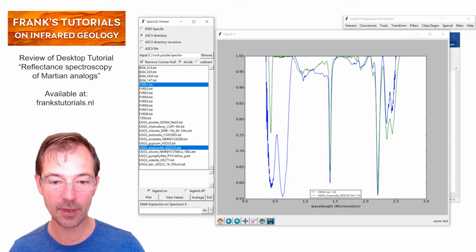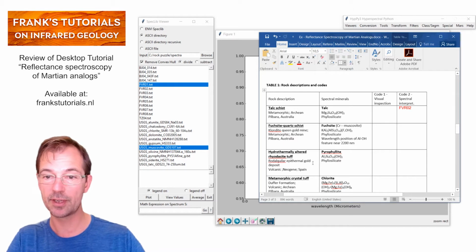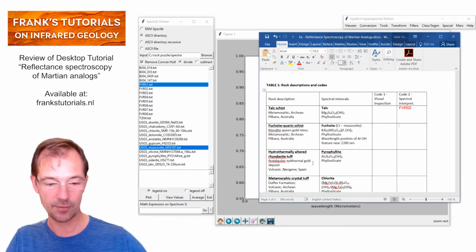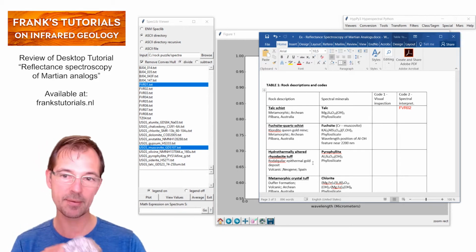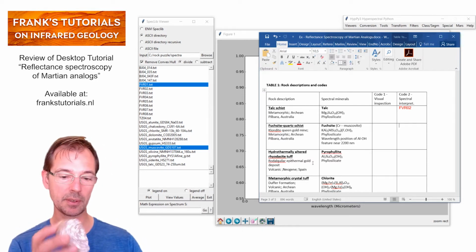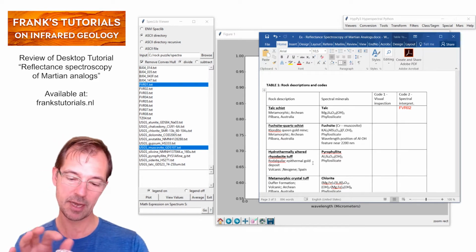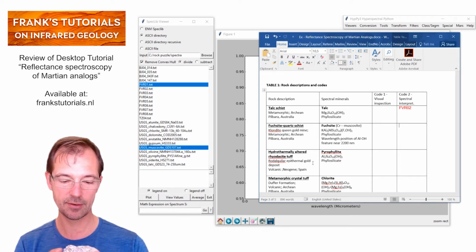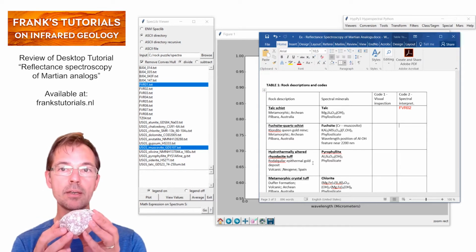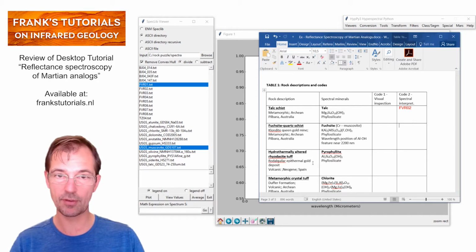Right. Then we go to the next sample, which is a hydrothermally altered rhyodacite tuff that contains pyrophyllite. If you look at all the different rocks, there's one rock that really looks like a clay-bearing altered rock. It's this one. What we're looking at here is a volcanic rock that has been completely altered. The matrix is highly siliceous, and the phenocrysts and lithic fragments have been completely altered to a white powdery mineral, so likely to be pyrophyllite.